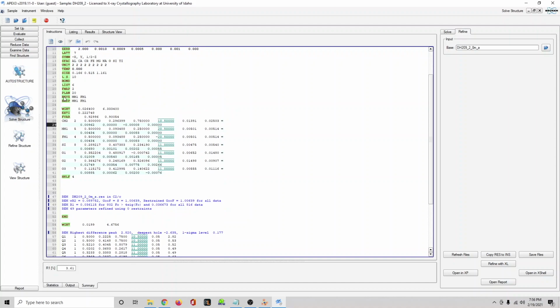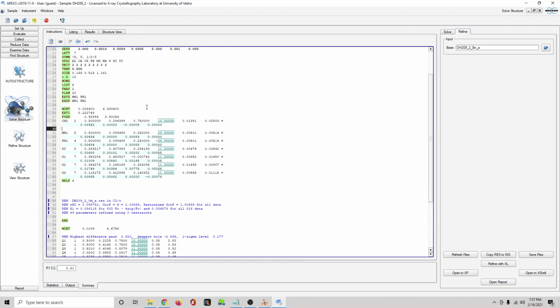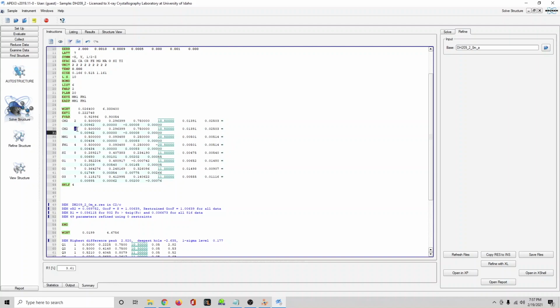So rather than using the EXYZ command, it actually does have a different atomic position. And we can retain the atomic displacement parameter of the other thing in the site. But we also have to use this ratio between, sometimes it's the calcium site, and then some small percentage of the time it's this alternate atom occupying that site, that slightly different position, but the same site, we'll call it. So what you do here is I'll just copy and paste this, duplicate it, and I'm going to start with saying it's magnesium, just because there's more magnesium in the sample. And normally the way that naming goes with split occupancies of this type is you call it prime. So this is MM2 prime.